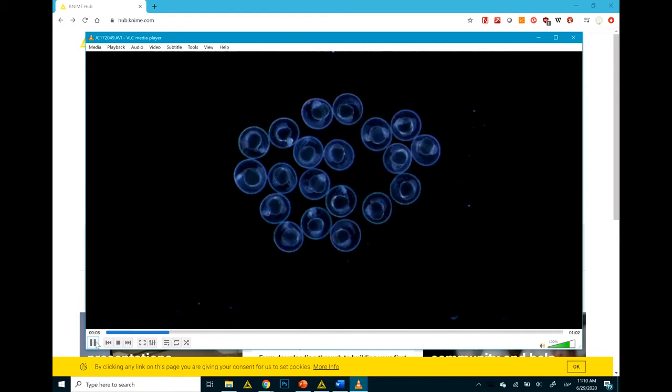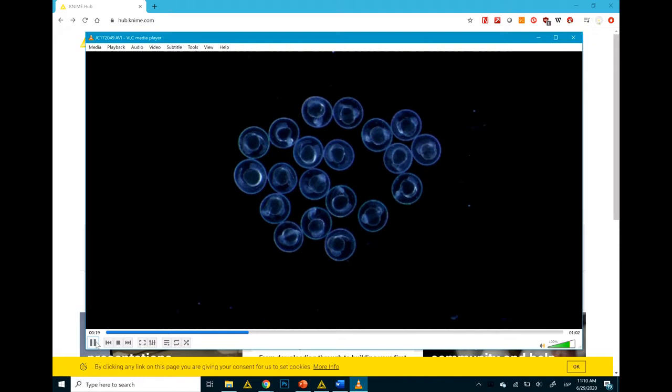These STCs are the first motor activity observed in the developing neural network of the zebrafish embryos, and their measurement is considered to be a behavioral test method which may be used to screen neuroactive substances, and also it may be used for general purpose toxicity screening.